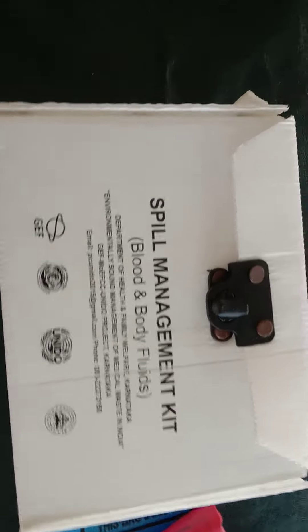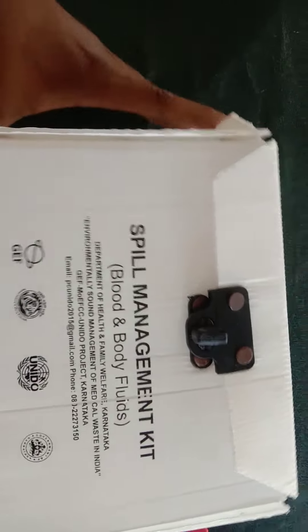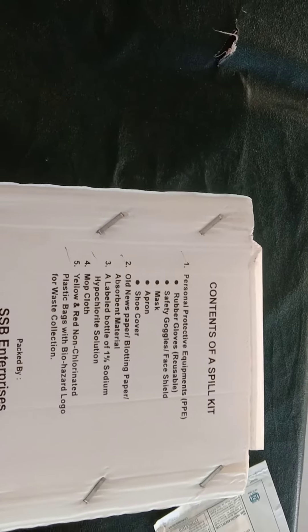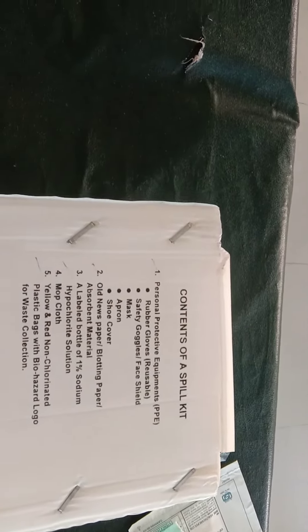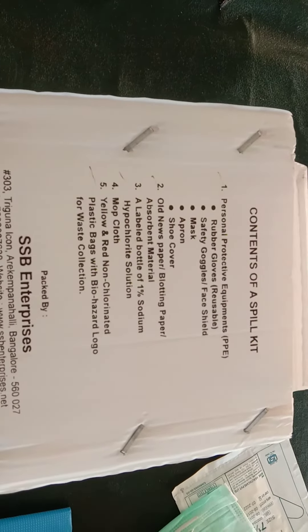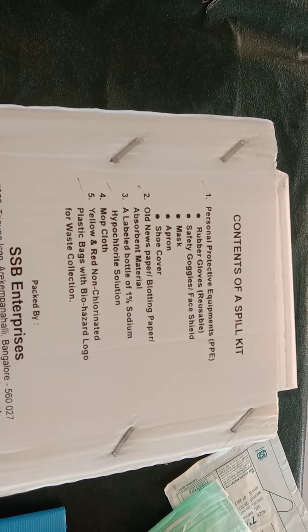This is the spill management kit, used for blood and body fluid spills. The spill management kit consists of personal protective equipment which includes rubber gloves (reusable), safety goggles, mask, apron, and shoe cover.